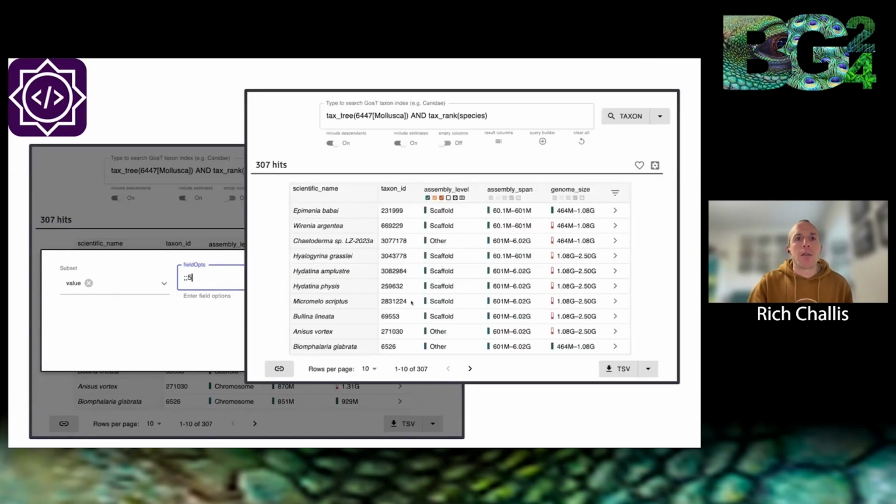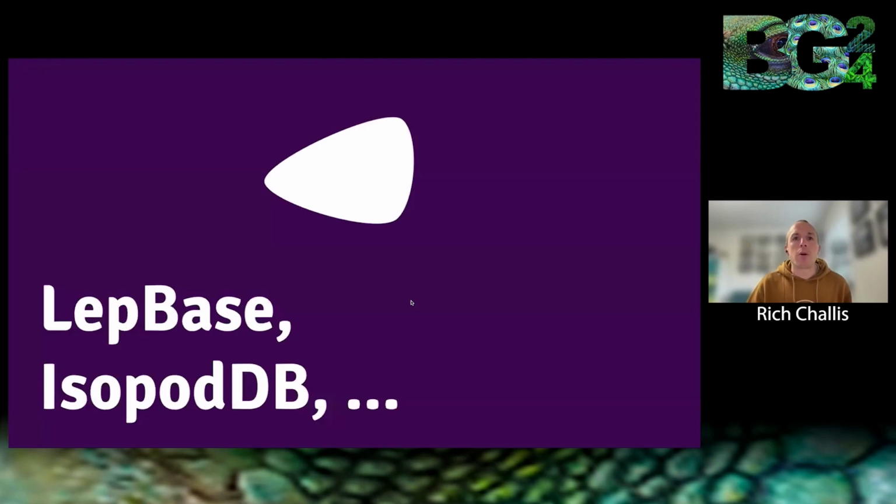Now, to output, this outputs a table of binned results, which can be passed to the Kinfin API. And the next steps are a work in progress, but soon Kinfin will be available as another report type for any MolluscDB search results. So looking beyond mollusks, we set this up to be reusable across any clade.